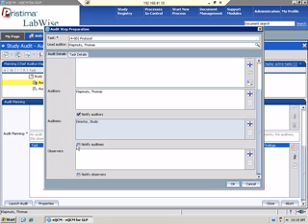And then if there were observers, you can also notify the auditee. So if you want them to get an email knowing that you're coming to do an audit, you can click notify, and it'll send them a notification. If you don't want to notify them, then you just don't check the box and you show up for your audit. You can also add observers, so if you know there's going to be multiple people performing the task or in the location of the audit, you can add them as well.